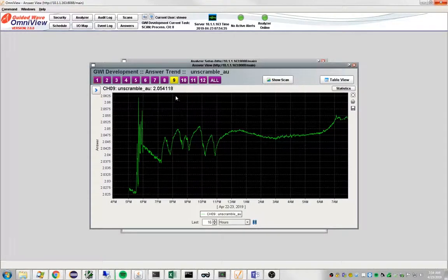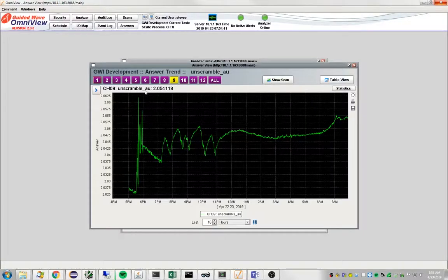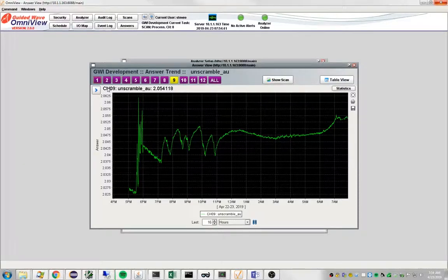These methods are producing answers for us, but you may ask what good is it if the only thing I can do is look at them in this answer screen.